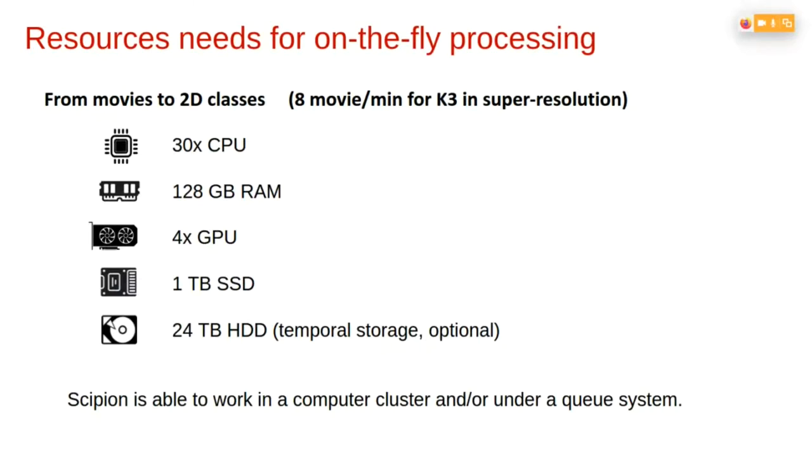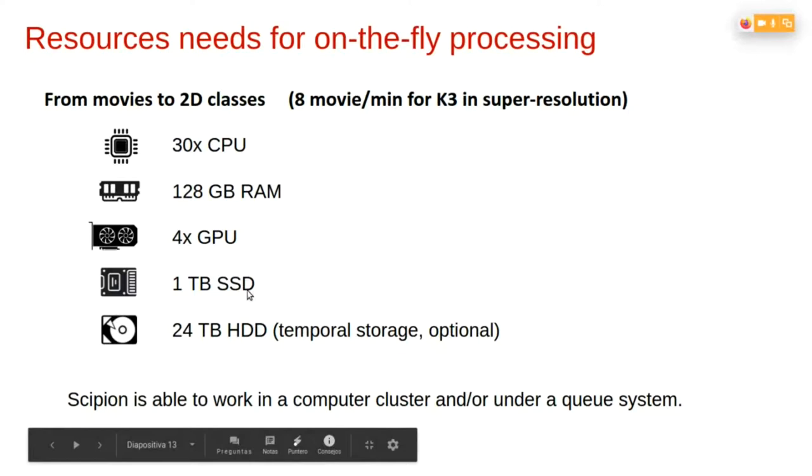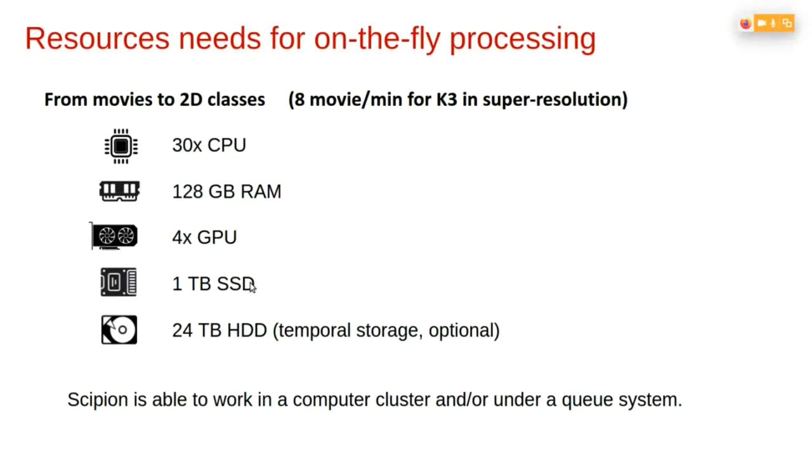And also, it's very important to have a solid state disk, because during the streaming acquisition, a lot of information is being written and read. So in order to follow the acquisition rate, a solid state disk is needed. But as you know, solid state disks are quite small. So for that reason, we strongly recommend, though it's optional, having another, bigger conventional disk in order to store the already processed projects from previous sessions.